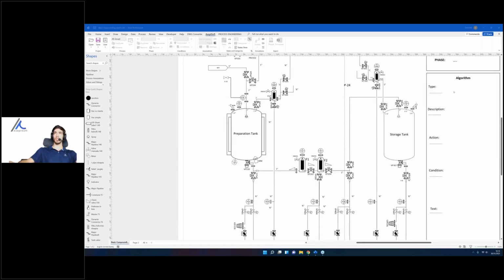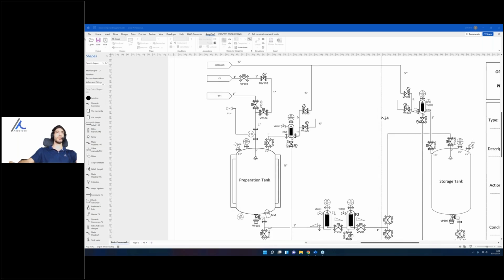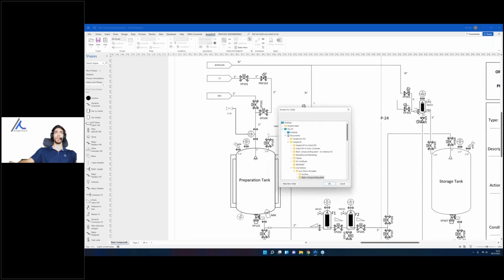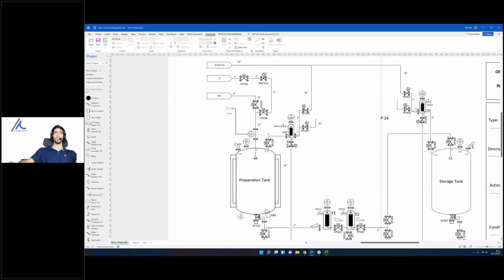This one is for now a static one, and it's like every P&ID you have seen so far. You can create it either in Microsoft Visio, because you have tools to create it, or you can import it from AutoCAD using our special tool once you have designed it there, of course. And now I'm going to bring it to life using AseptSoft. That means I'm going to link it to an AseptSoft project. Once I specify the AseptSoft project, you can see that everything gets colored.